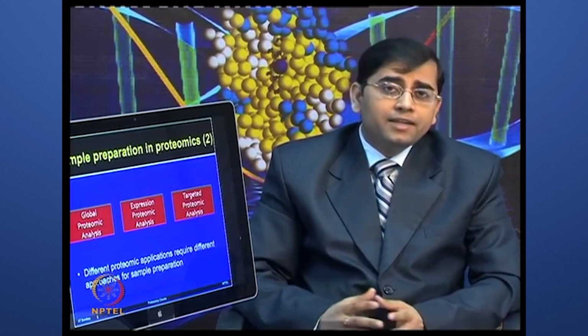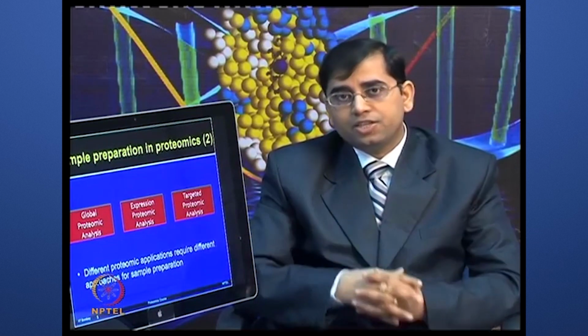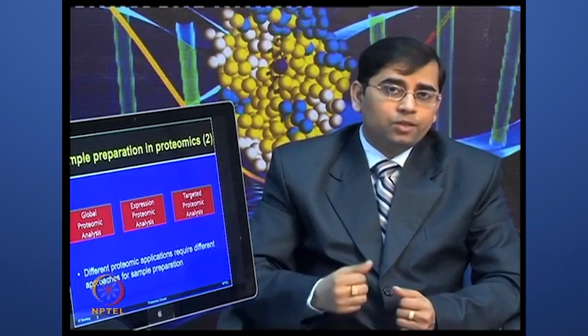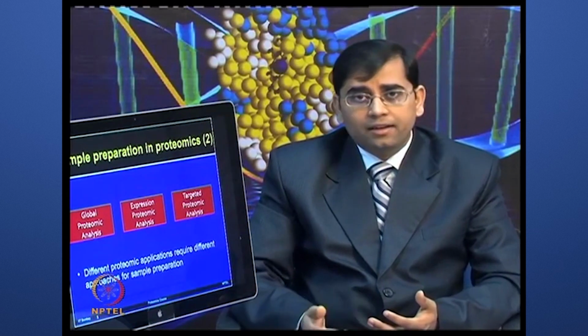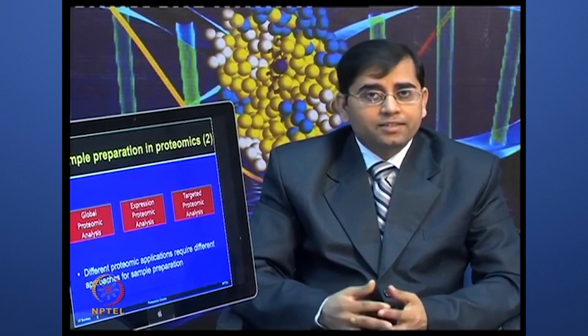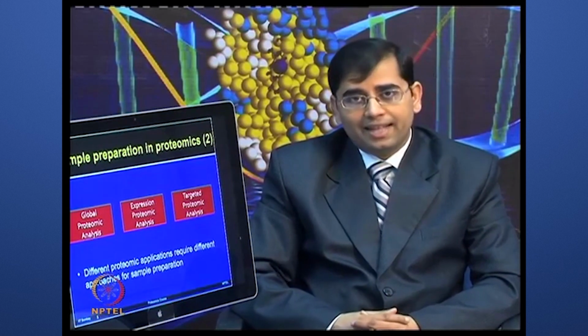Now, when you are looking at targeted proteome analysis, you just want to pre-fractionate your sample in such a way that only that particular component is isolated, and then all the proteins from that organelle or cell are extracted. So, different types of strategies need to be used to perform these types of proteomic analysis.